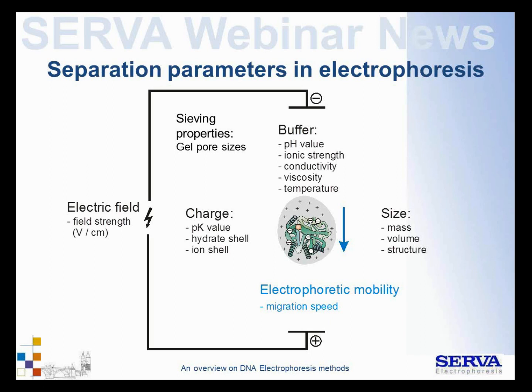And the temperature is also very important. The higher the temperature, the higher the mobility. And in DNA sequencing, where you work under denaturing conditions, in the past when gels were used, there was very often the problem that the temperature in the center of the gel was higher than on the two lateral sides. So people were using heated gel plates for running the sequencing fragments, and in this way achieving a straight front and better comparability of the band positions.